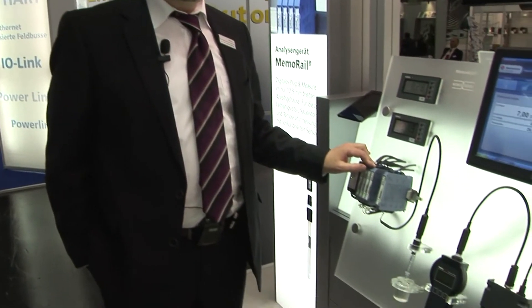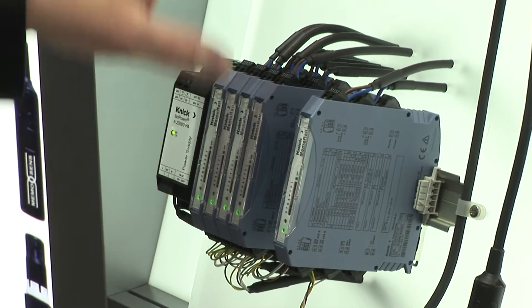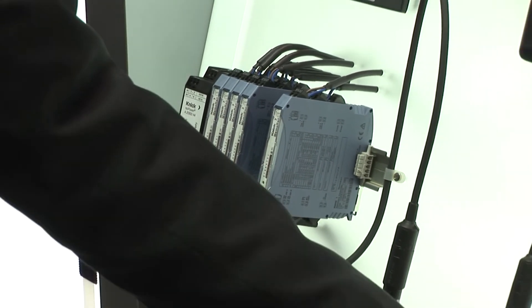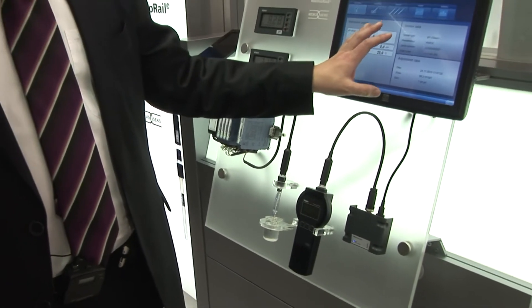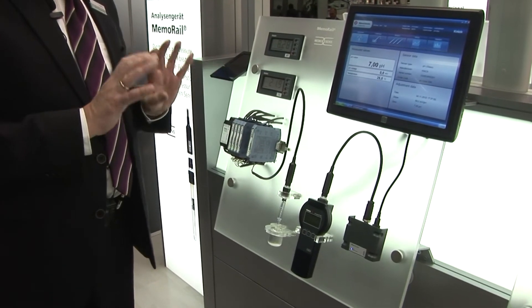Now to the process analytics. We have a fully new revolutionary concept which we call MemoRail. MemoRail is a process analytical transmitter mounted on a DIN rail. You can connect our digital sensors to this concept. There is no indicator needed because the whole concept is MemoRail and MemoLink, which is a USB link from the sensor to the PC. With the PC tool you can calibrate the sensors, and then combine the sensor to the MemoRail as a plug-and-measure system without any problems.